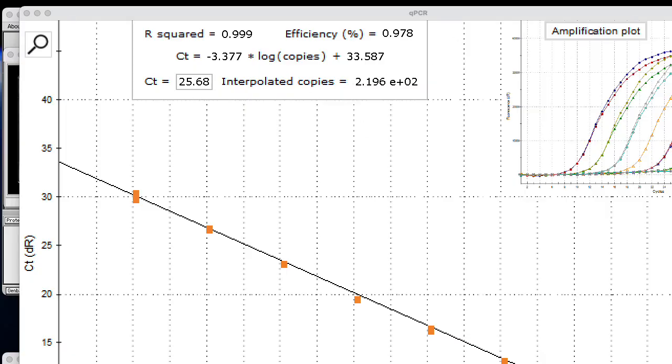So the number I'm going to put in here for Anna at 1 month, using again the honeybee data as a surrogate for Anna's data, the average value of the CT for E4, E5, and E6 for those 3 wells was 22.64. So I'm going to type that in.